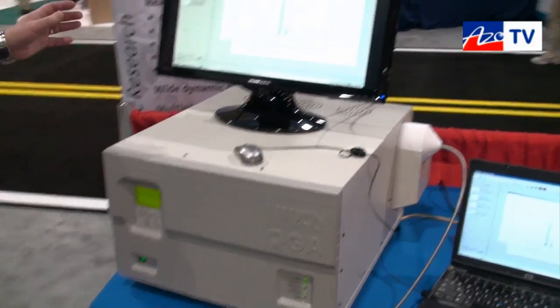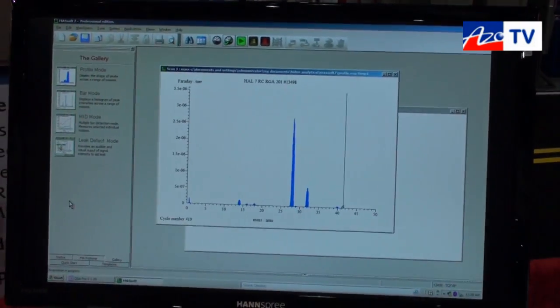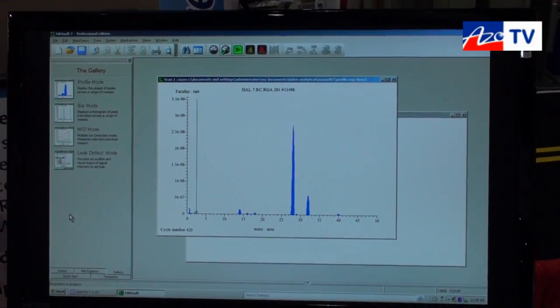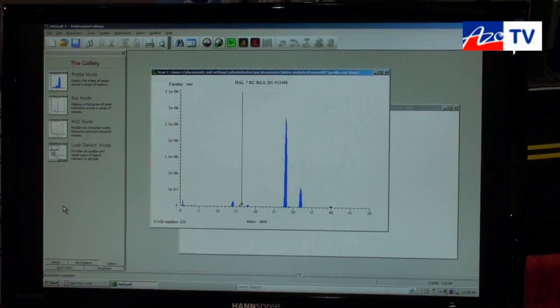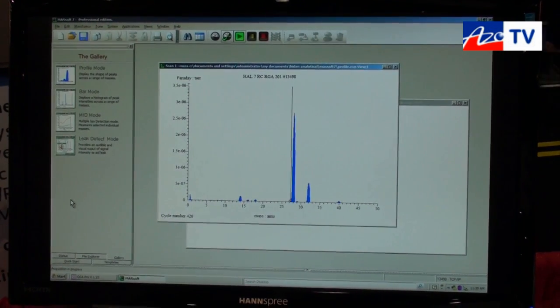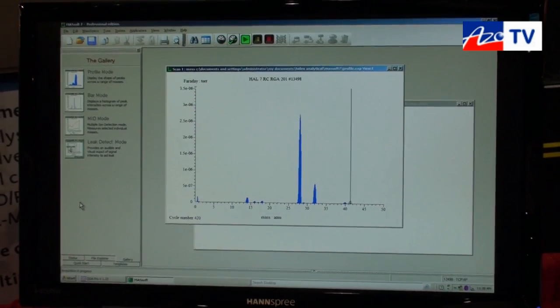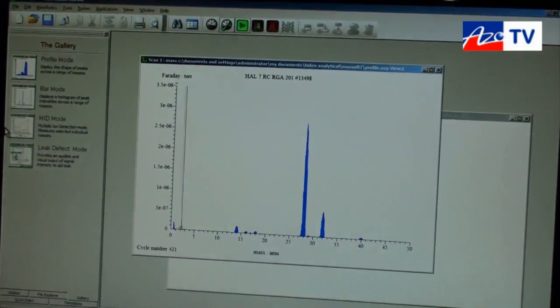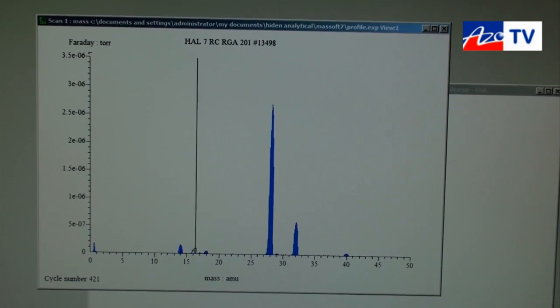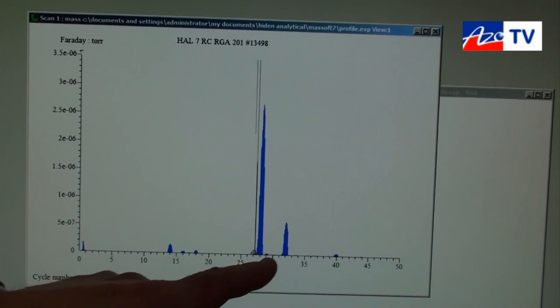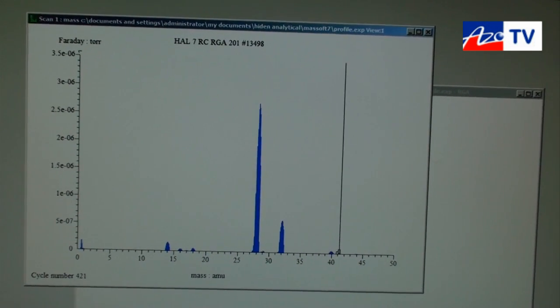If we take a look at the software on display here, this system uniquely combines two software suites. We have our traditional MassSoft Pro software that controls the instrument and provides the user with full control of all instrument operating parameters. On screen at the moment we're doing a profile spectrum of the air gases being sampled through the heated capillary — we can see mass 28 nitrogen, mass 32 oxygen, and some of the other lower-level peaks in the spectrum.